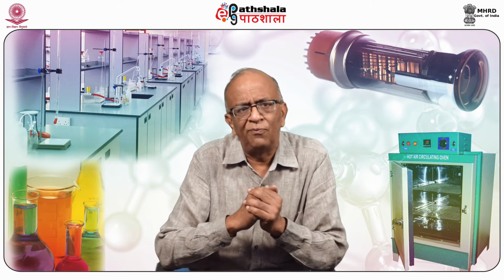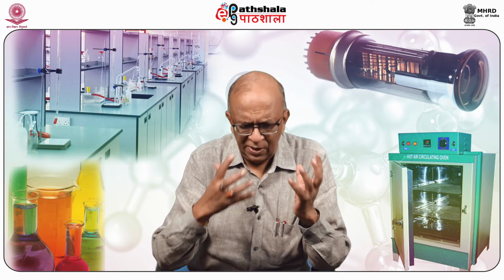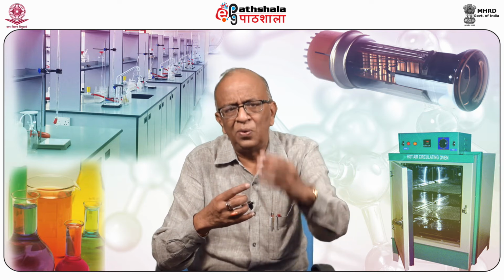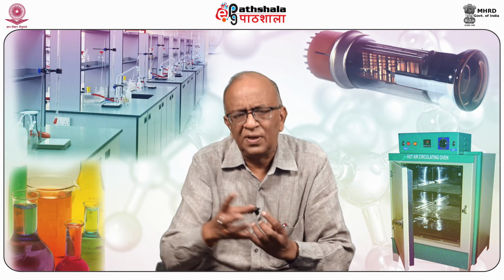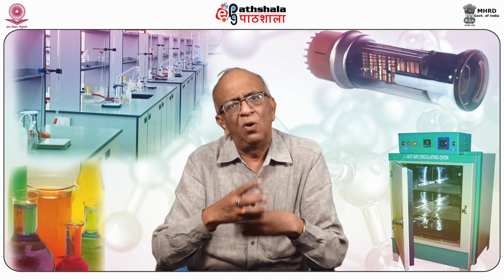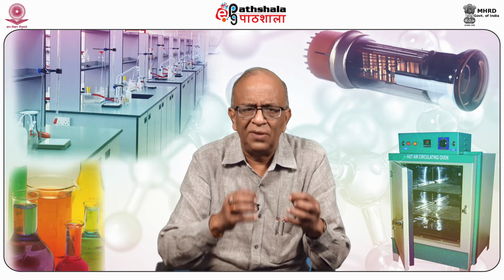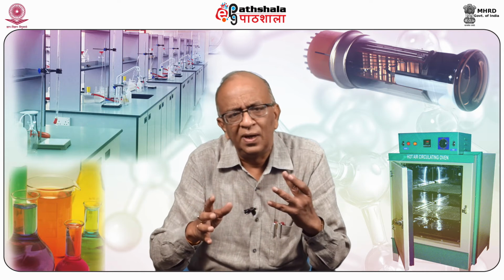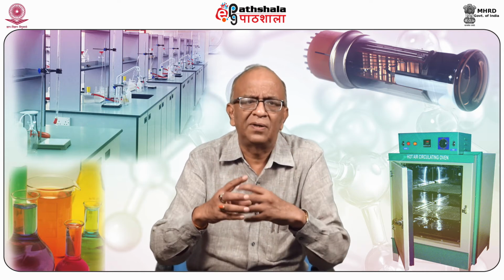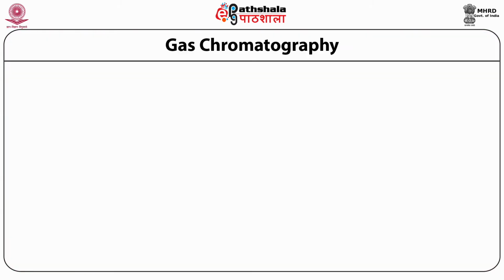As you can see from figure 4, the column is placed at a fixed temperature in an oven, and as soon as the sample is injected into the column, it vaporizes, and then along with the gas it moves over a liquid. Due to the interaction between them and the difference in the partition coefficient of different components, separation takes place, and then it goes to the detector, and by using different types of detectors, samples are identified.